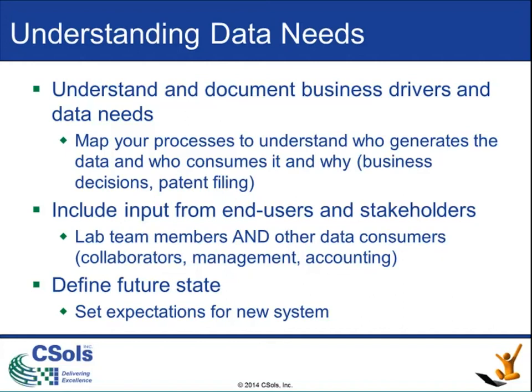And then I'll also talk a little bit about defining the future state and setting expectations for the new system. So throughout the talk, I'm going to highlight areas where lab informatics experts can be especially helpful in the process. And I'll also touch on specific areas to pay attention to if your e-workbook requires validation in a regulated environment.